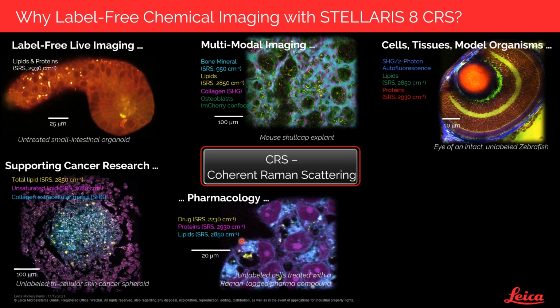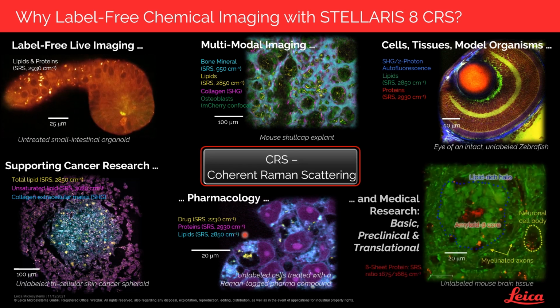In pharmacology, we can ask, where does my drug go? Shown here in yellow is a small molecule drug that has been compartmentalized inside vacuoles in the cells that it has interacted with. And the cellular background is shown here in the protein and lipid contrast shown in magenta and cyan. We can support medical research at the basic, preclinical, and translational level.